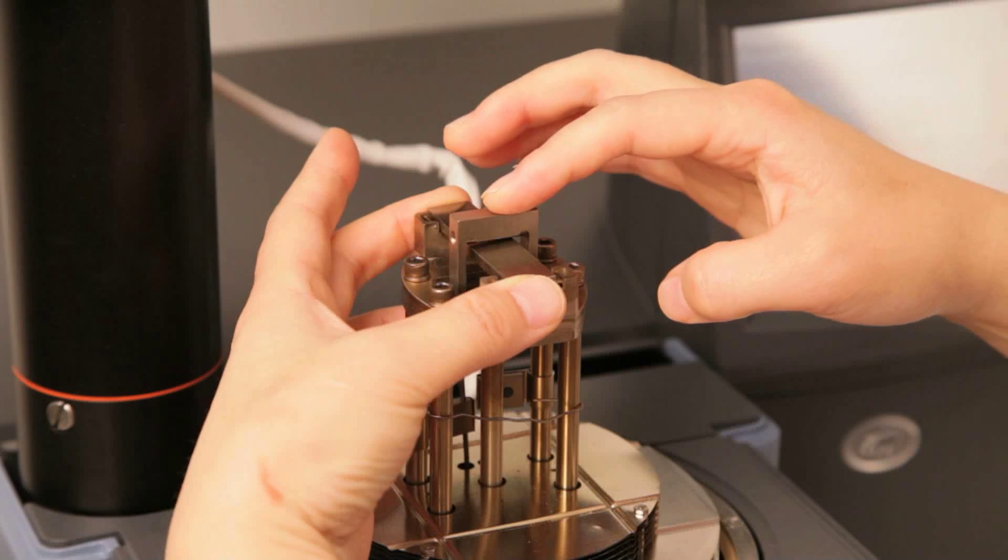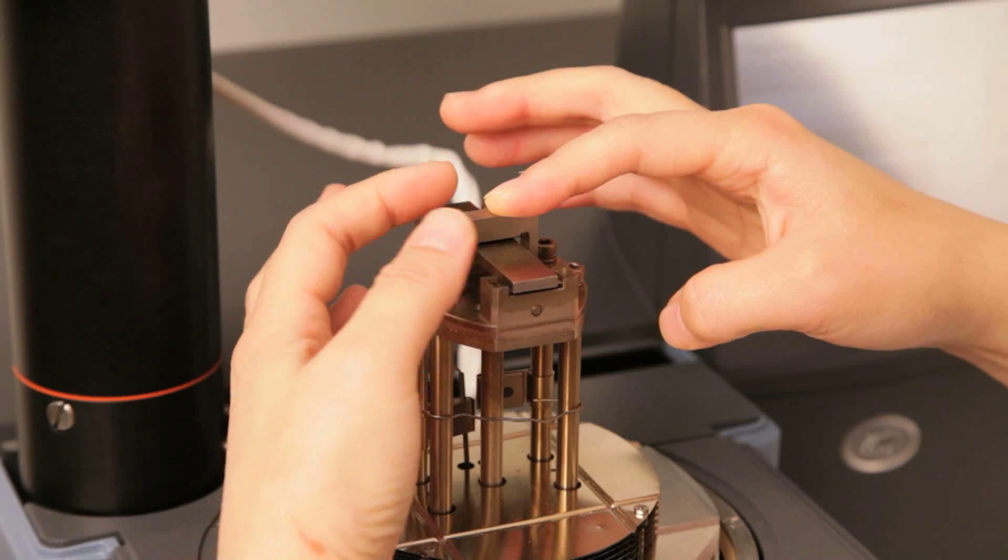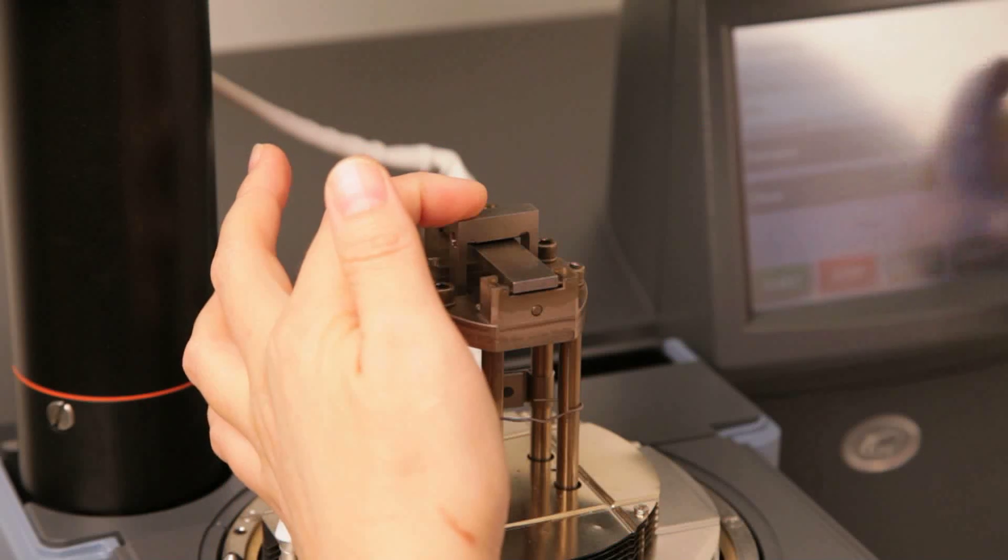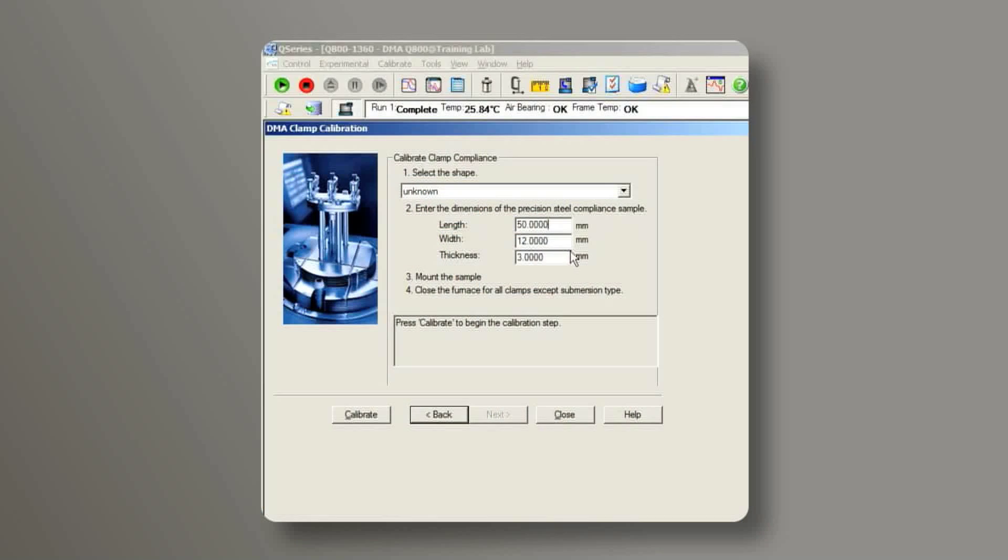Make sure the movable clamp is in touch with the bar, then lock the drive shaft from the touch screen. Enter the dimension of the steel bar to the software.